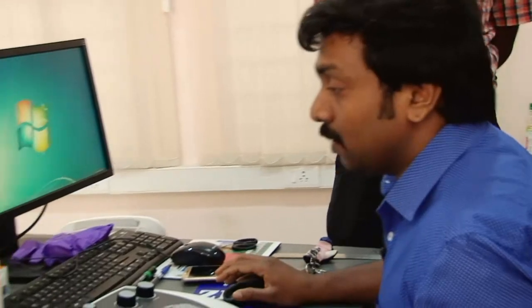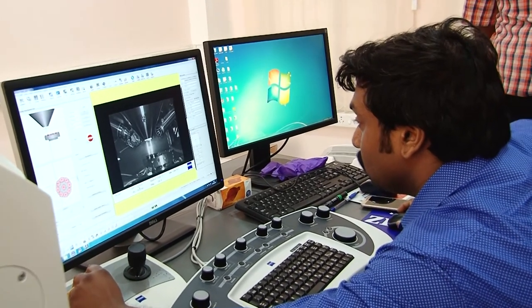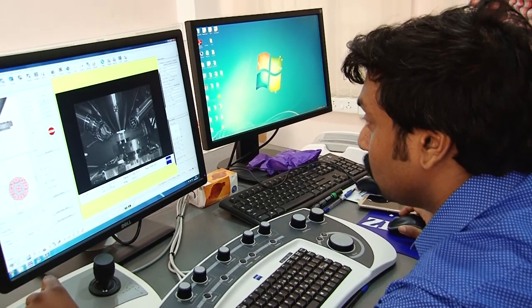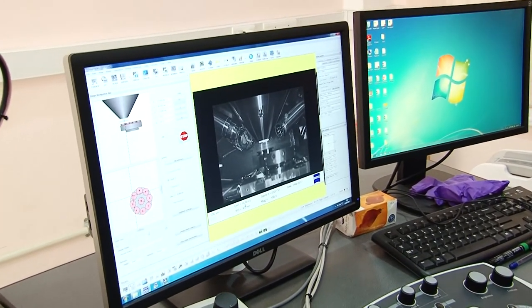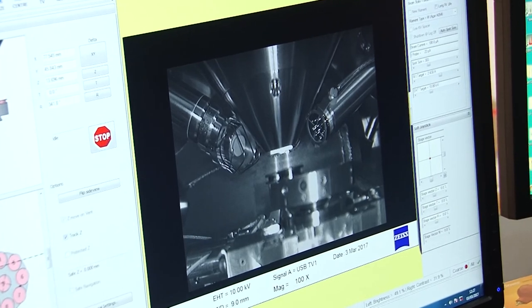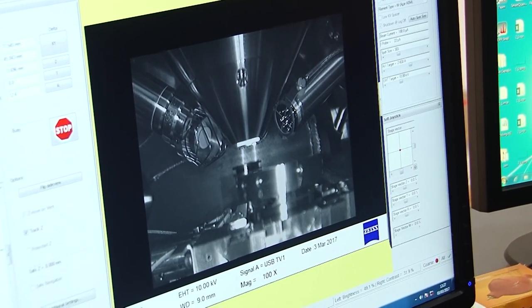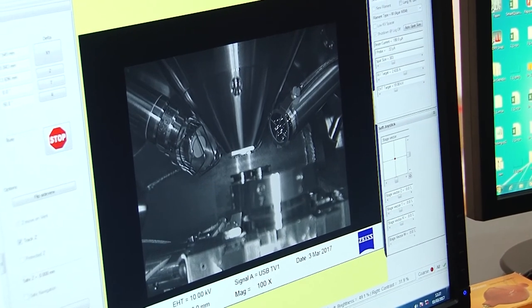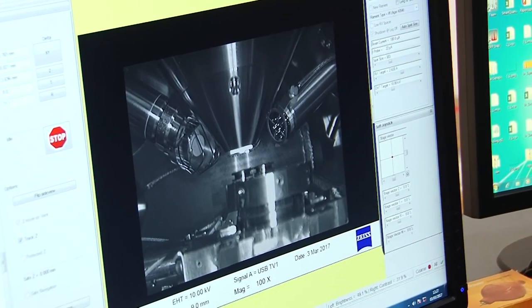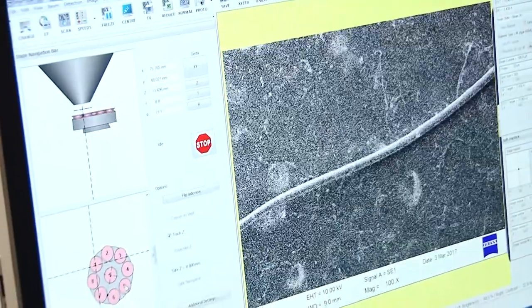I have already coated some samples. First I need to adjust the working distance. And now I have to do sample selection. I have taken two slots, sample number 1 and sample number 2. So I am selecting slot number 1. This is a hair, so we are going to focus it.